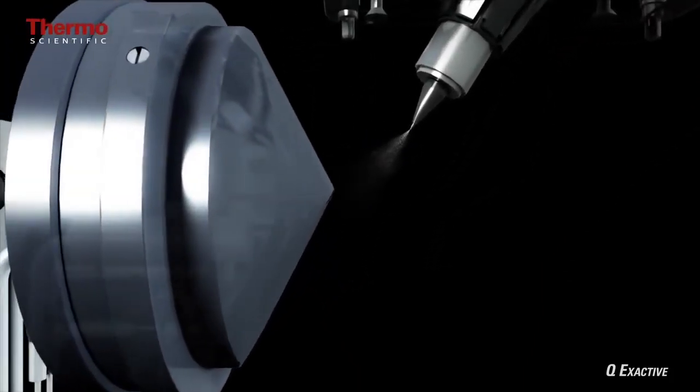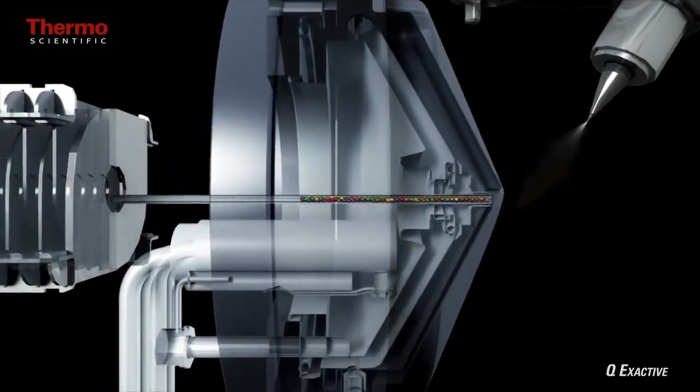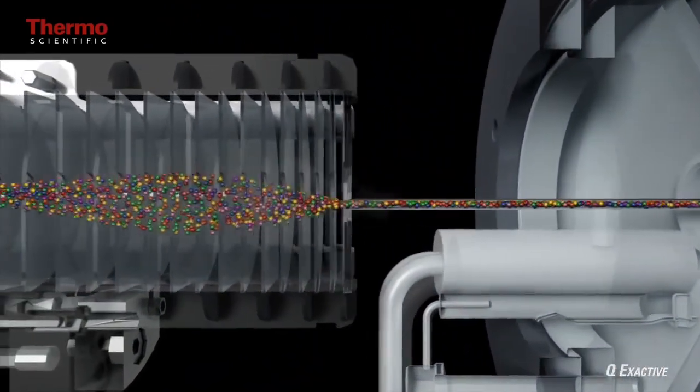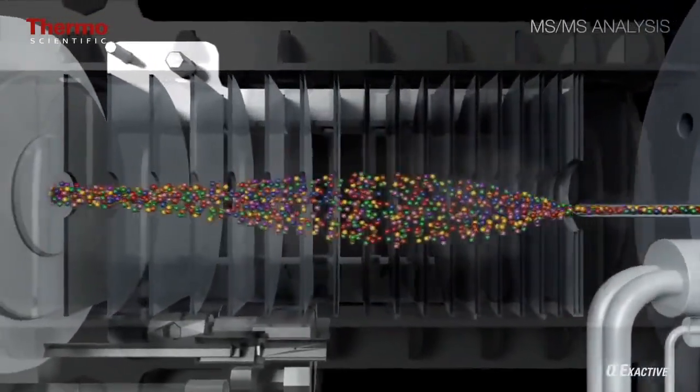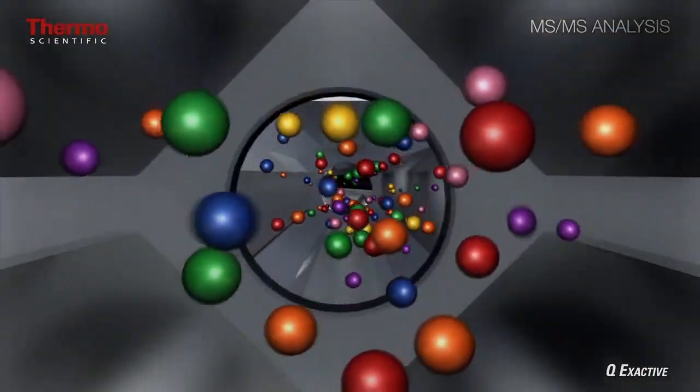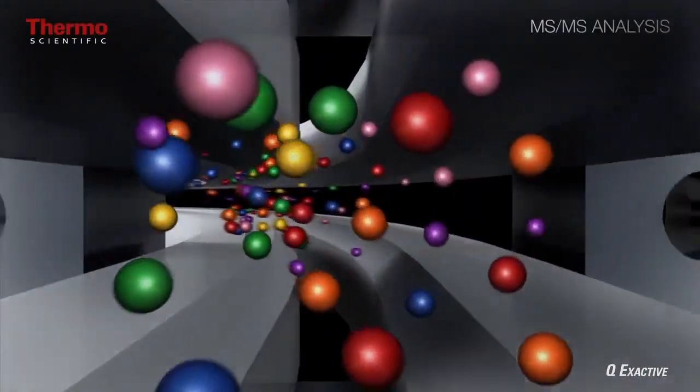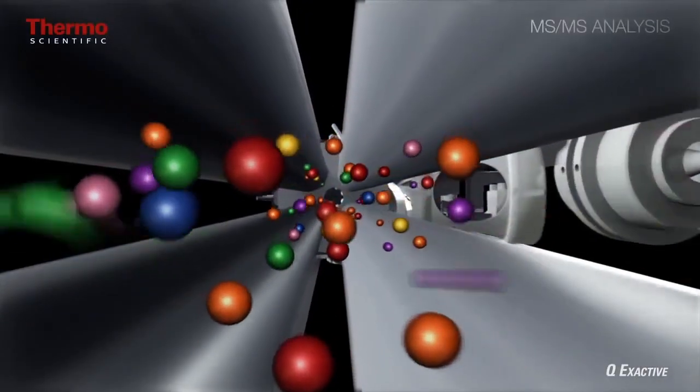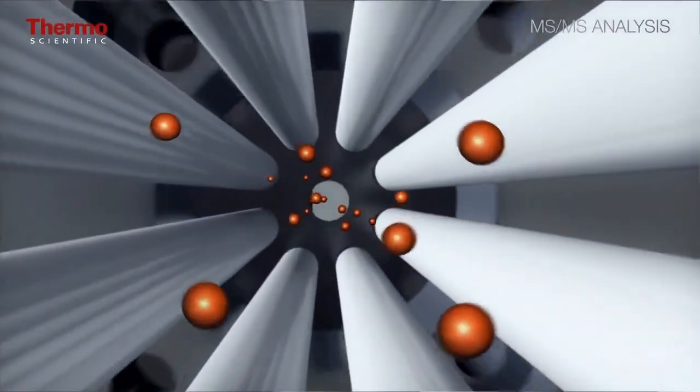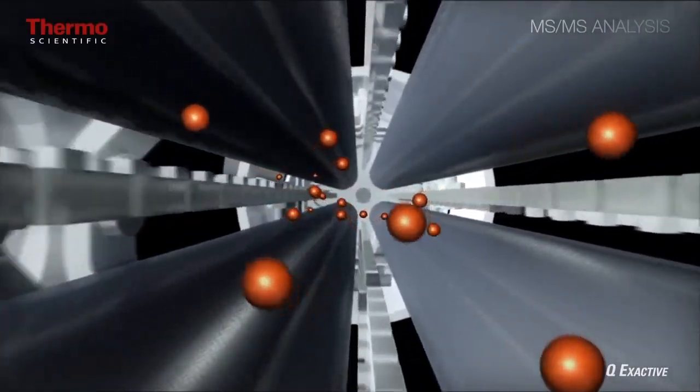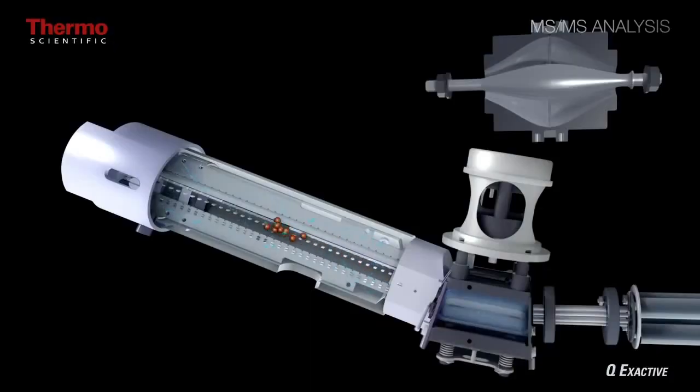Now, this will be an MS-MS analysis or tandem mass spectrometry. Once again, ions are produced at the source. They are then captured and focused for effective transmission. Uncharged neutral species at this point are filtered out and only ions of interest are being selected, in this case being the orange ions. These are then sent into the collision cell for collision-induced fragmentation into fragment or product ions.